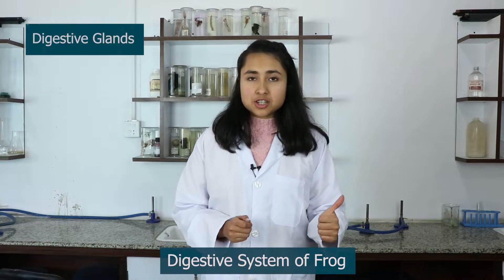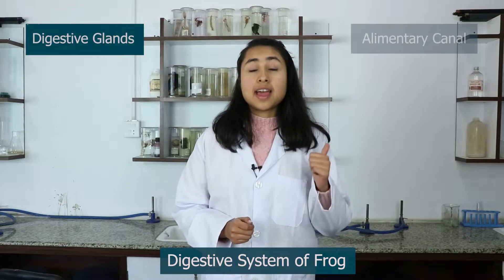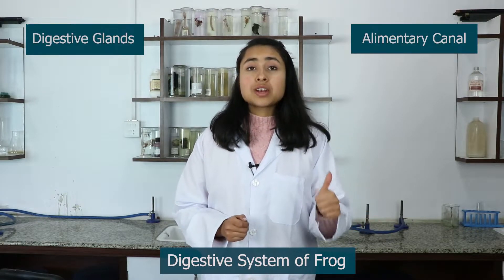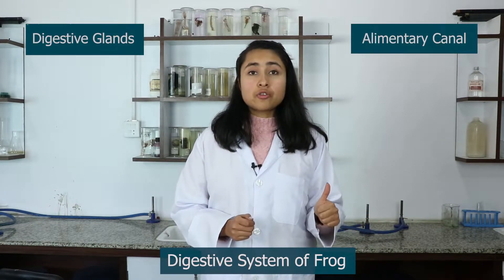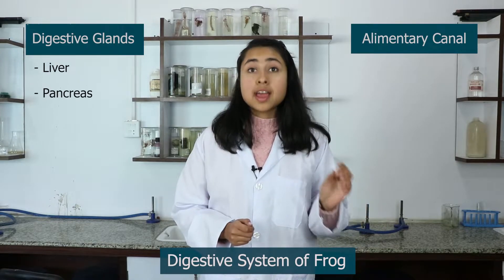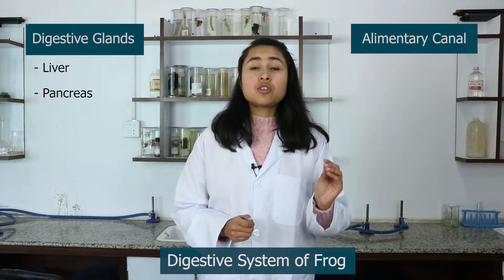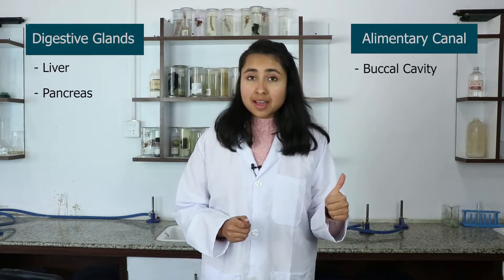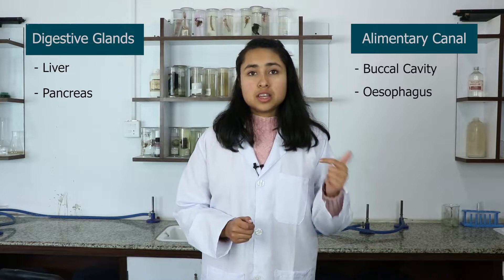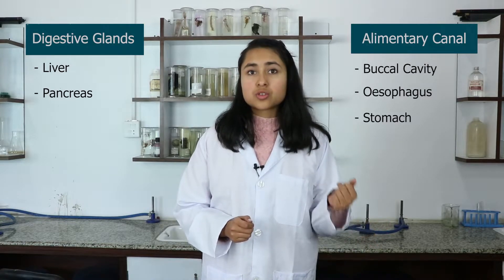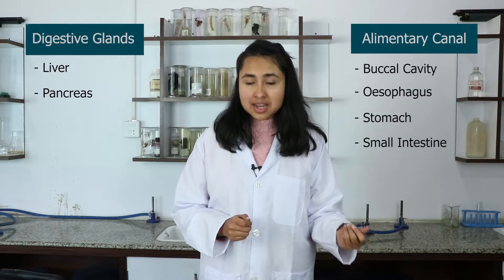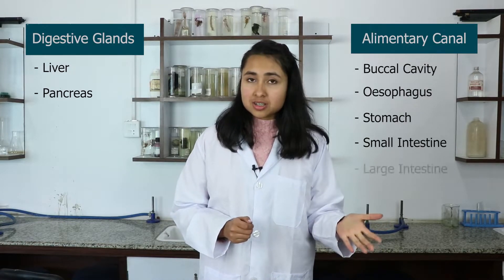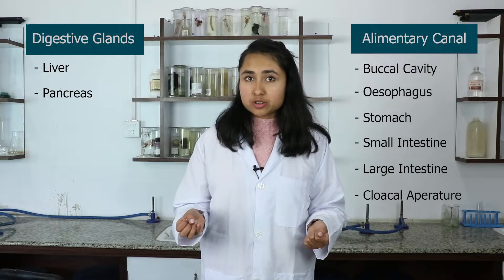Today we are going to expose the digestive system of frog. The digestive system of frog contains digestive glands and an alimentary canal. The digestive gland consists of liver and pancreas. The alimentary canal of frog consists of buccal cavity, esophagus, stomach, small intestine, large intestine, and cloacal aperture.